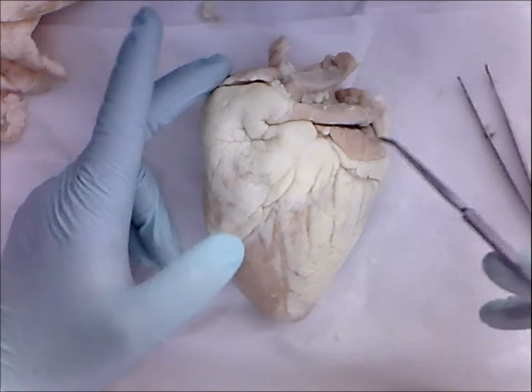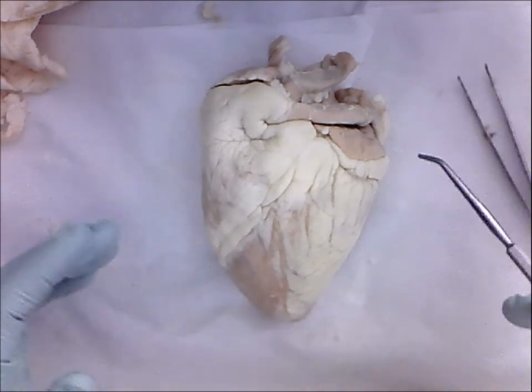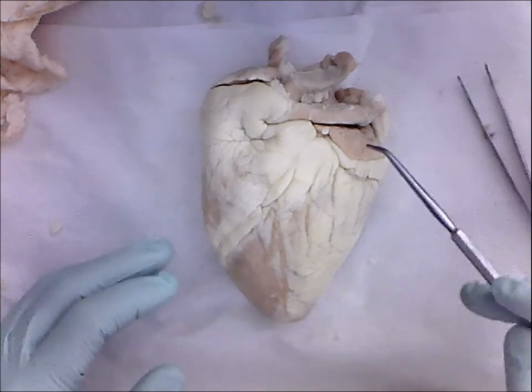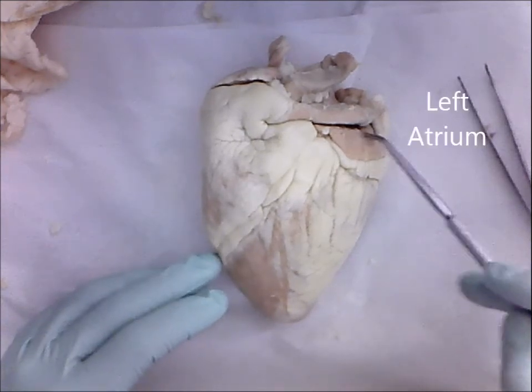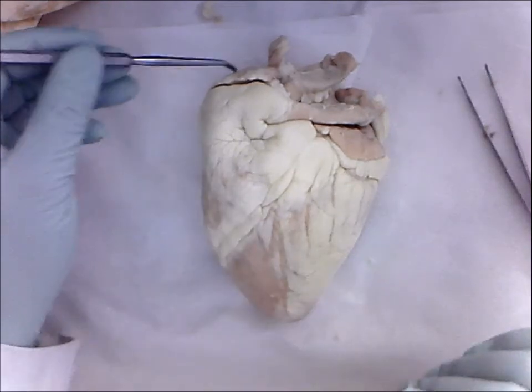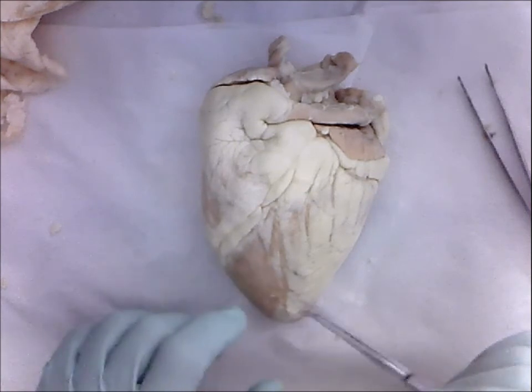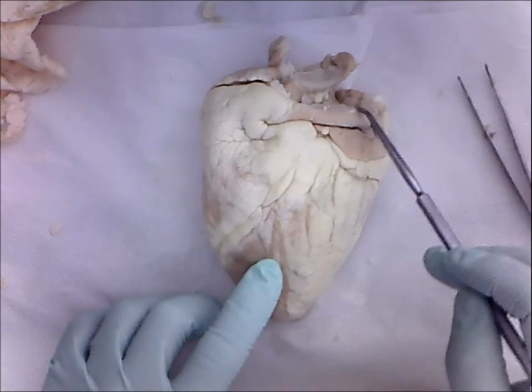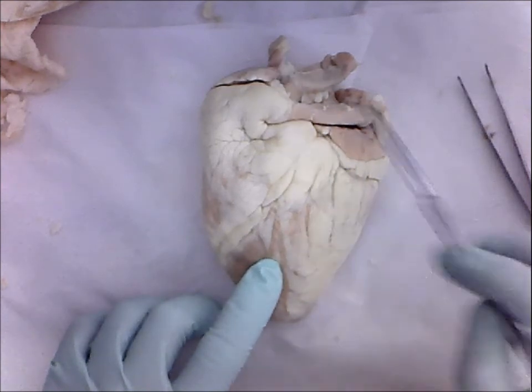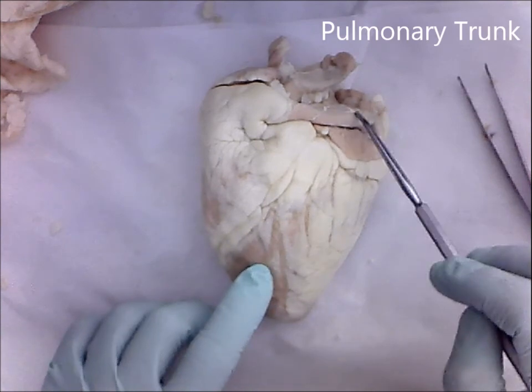Underneath the two auricles are the atria, which are the upper chambers of the heart. For our purposes of this dissection, we'll simply call the auricles atria. So we'll call this the left atrium, and we'll call this the right atrium. Another structure you have to be able to identify from an anterior view is this vessel right here, found between the two atria. This is called the pulmonary trunk.